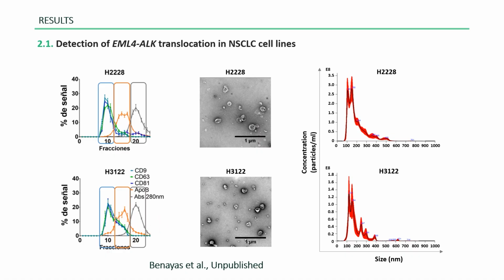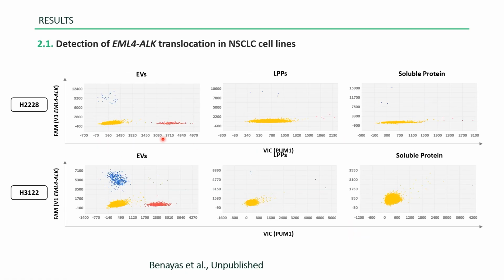And when we did so, you do see here that the positive signal of the transcript was detected almost exclusively in the extracellular vesicle component, and we scarcely saw some dots in the soluble protein or in the lipoproteins. So now we wanted to improve this with plasma from patients.